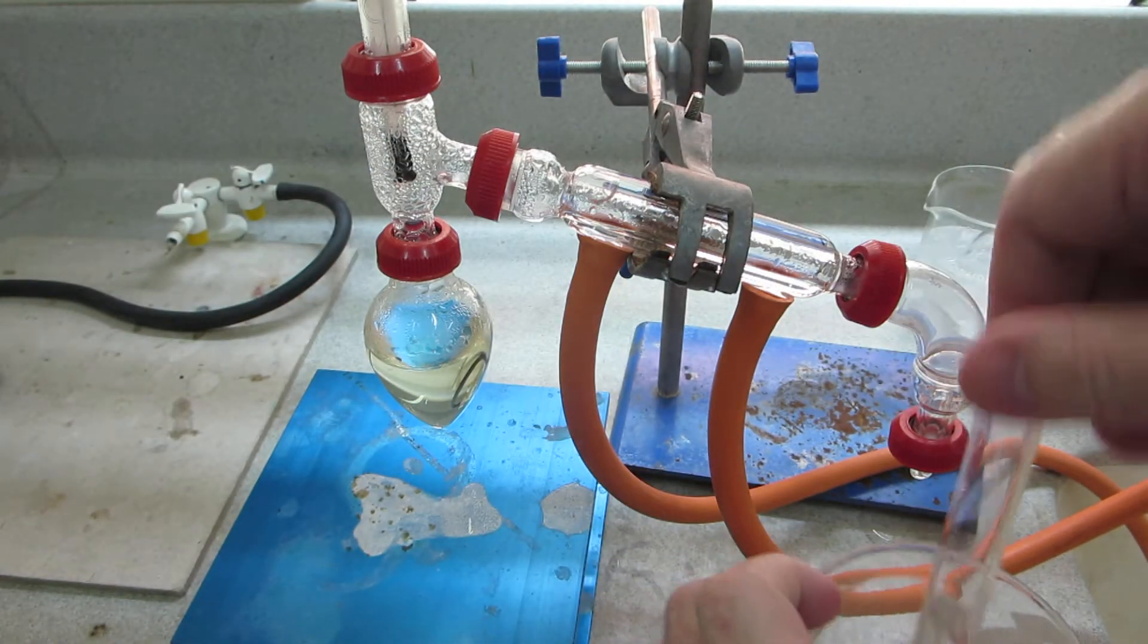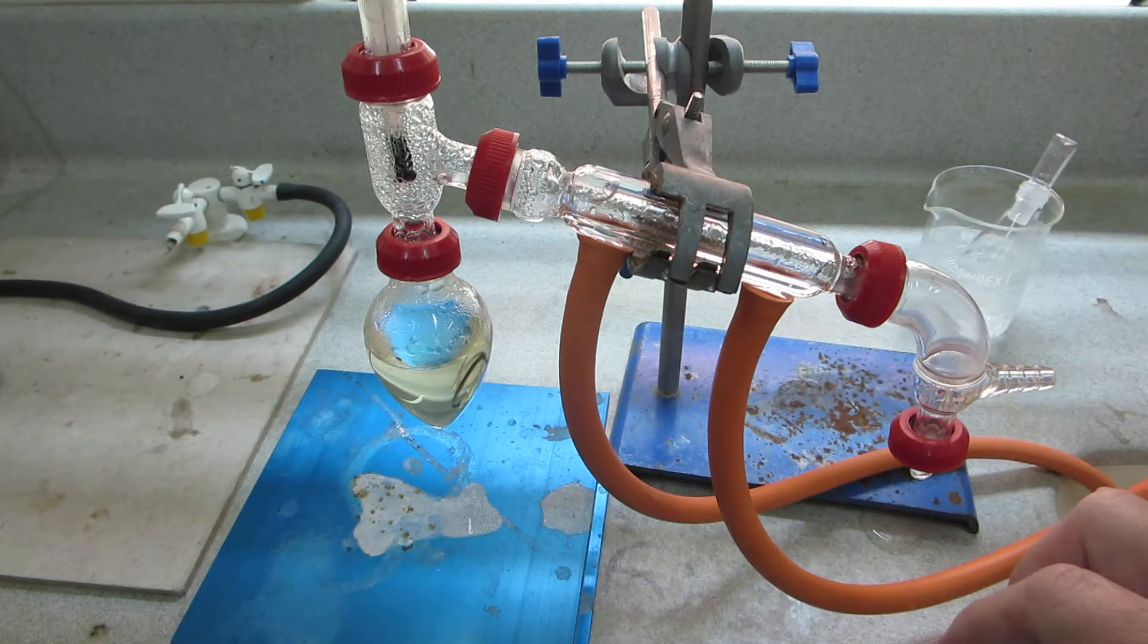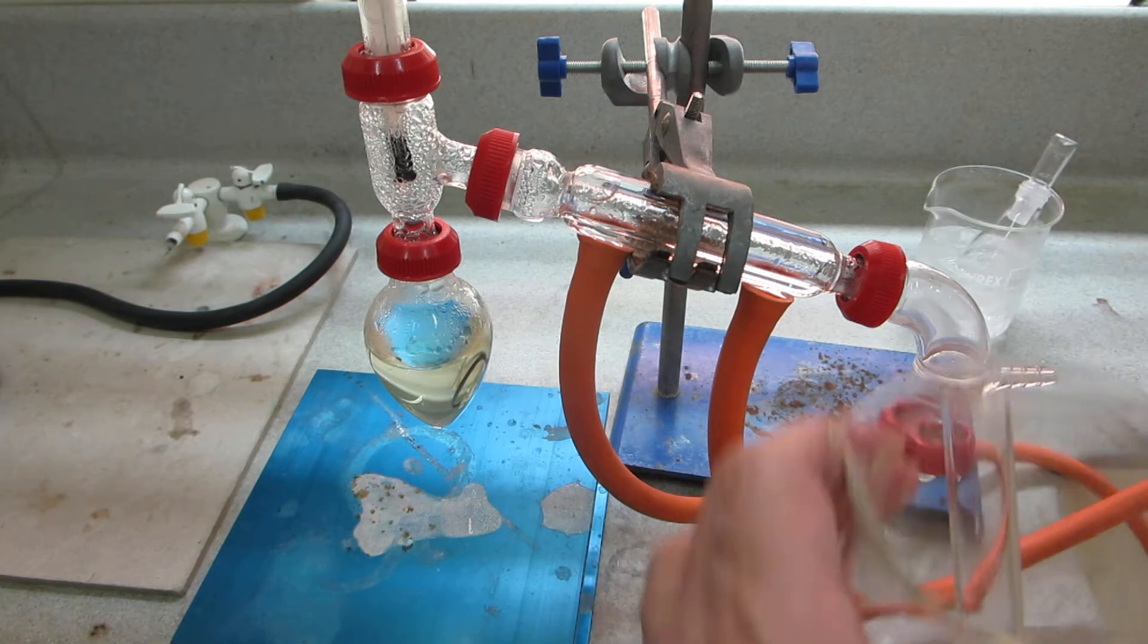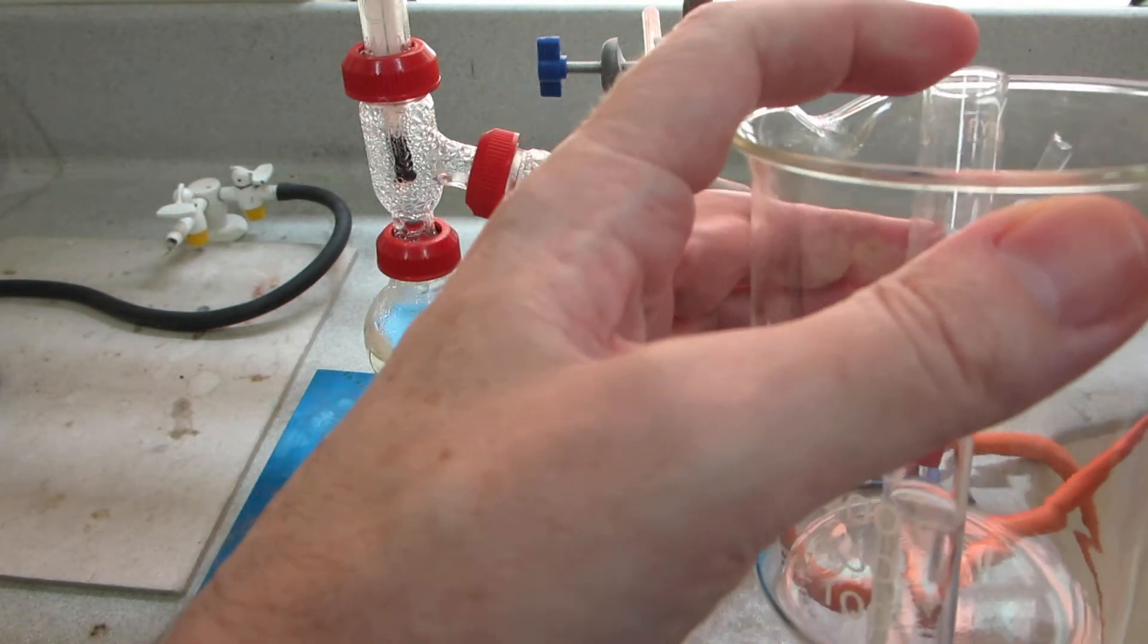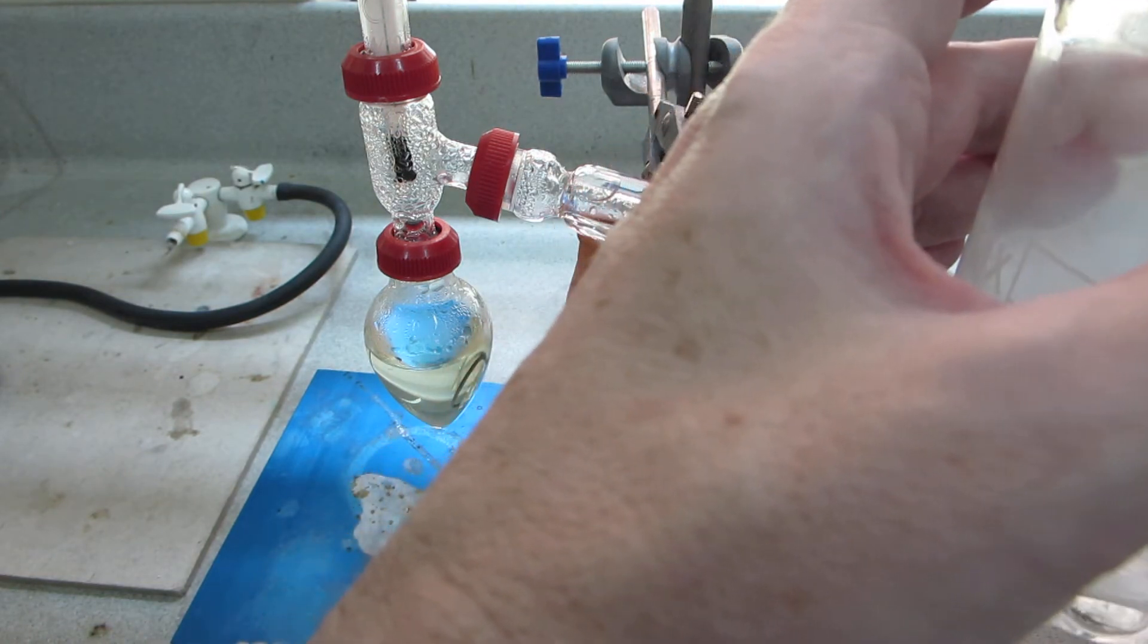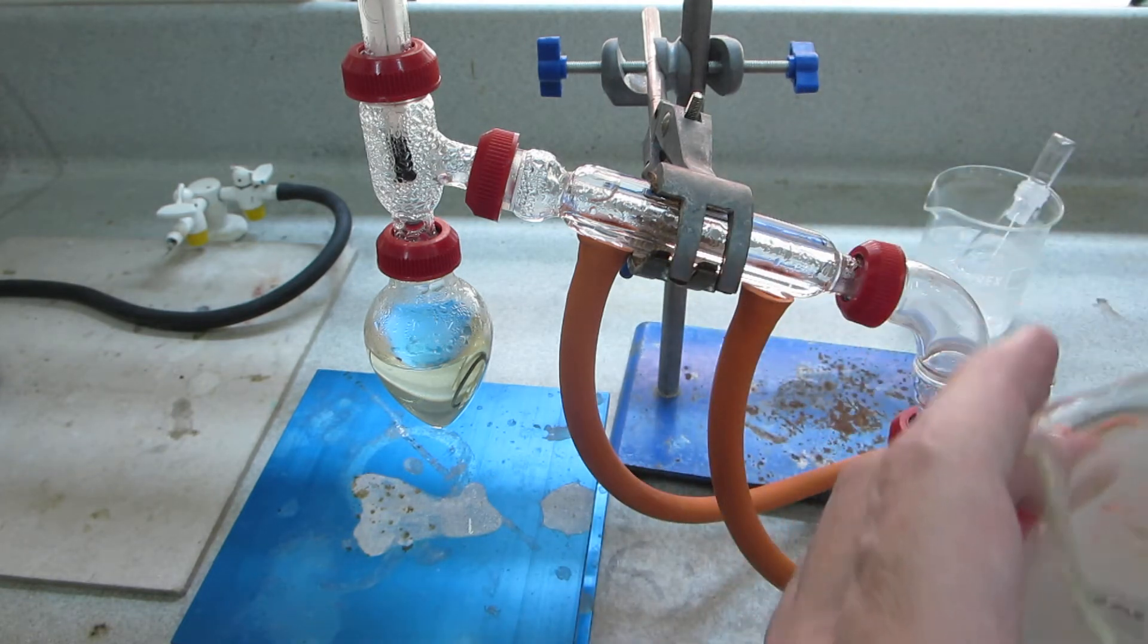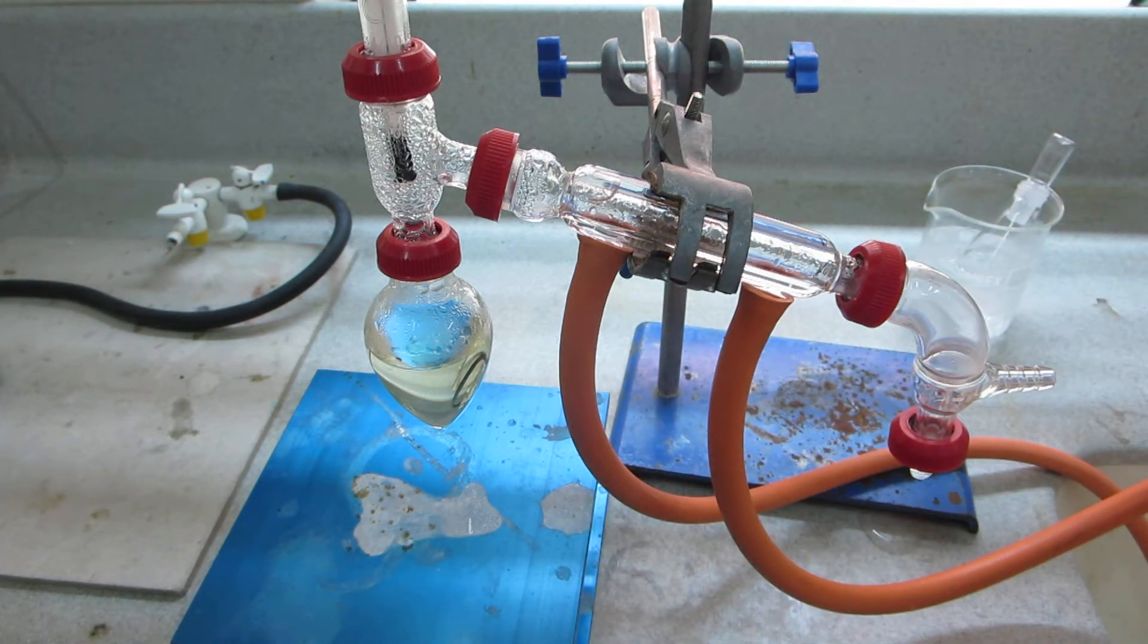And now we need to surround our tube with hot water. We've got a kettle here, and what I've found is that the ethanal product is so volatile that it's best to only half immerse the tube in hot water like so. We've got another camera at the bottom, so we'll monitor that down here.